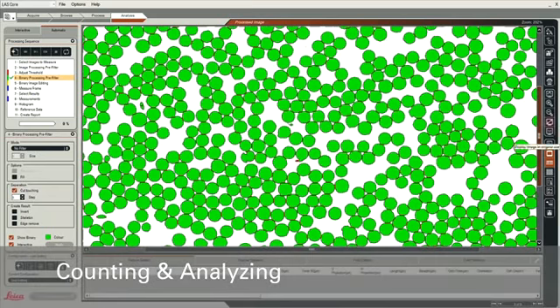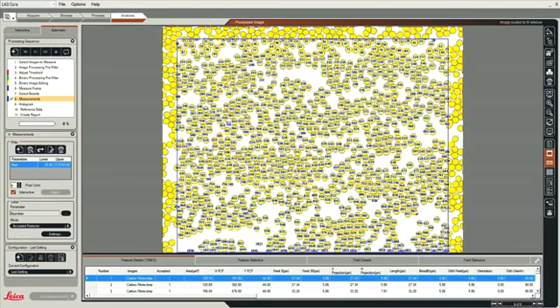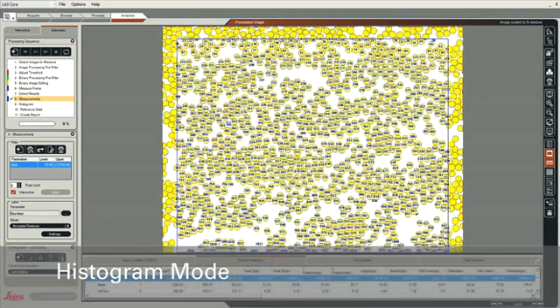So if I select the count operation under Measurements, you will see that instantly we've counted over 1,000 fibers. You can actually see we counted 1,066. Of course, when you have this many objects in the field of view, it is very complex to understand the details. All of the details are presented in this table. And we also present the averages, so we get the means and standard deviation of all the measurements that we made here.